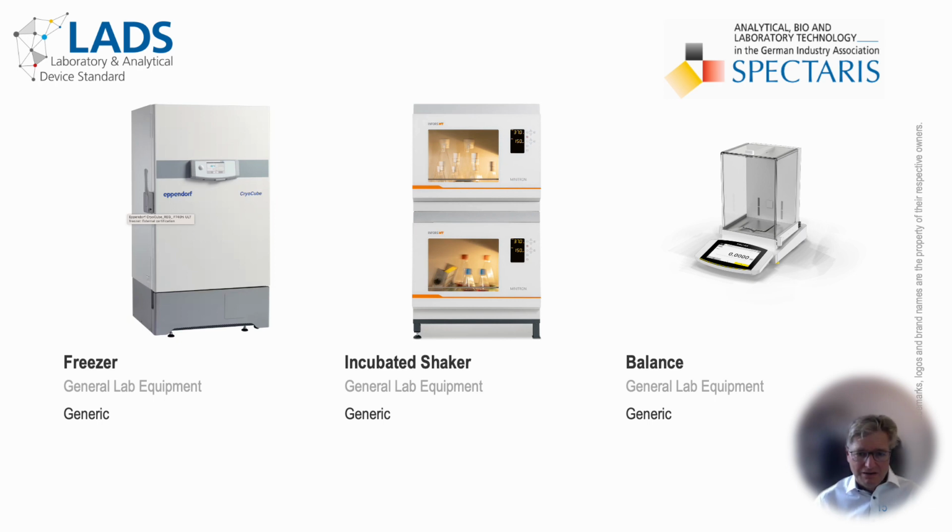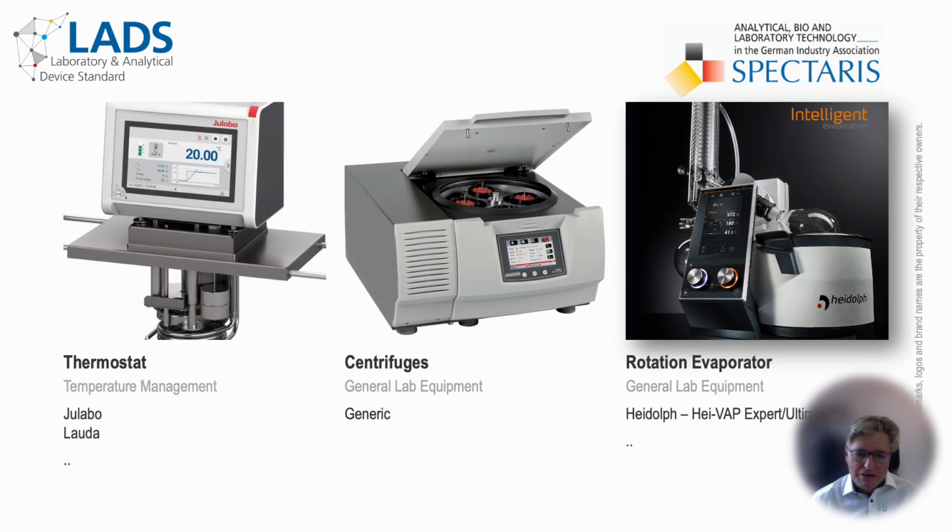In the final part of today's presentation, it will play a major role by enabling a virtual laboratory for interaction with collaborative and mobile robots. So stay alert and keep an eye out for exciting demonstrations. And yes, there is much more general laboratory equipment that can be handled by LADS OPC UA.